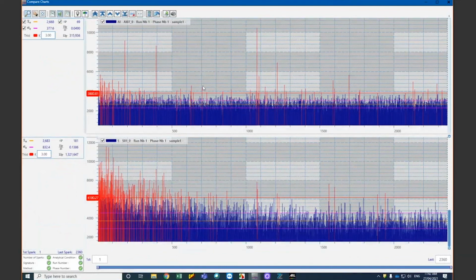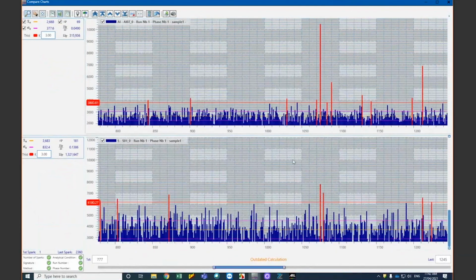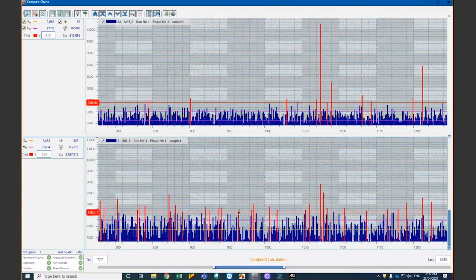And then we are able to investigate what the coincidence would be. And now to adjust some parameters, people can play with the threshold to see in which way we can get more coincidence, or whether it is supposed to have more coincidence or not. So that's the way we can play with this offline investigation tool.